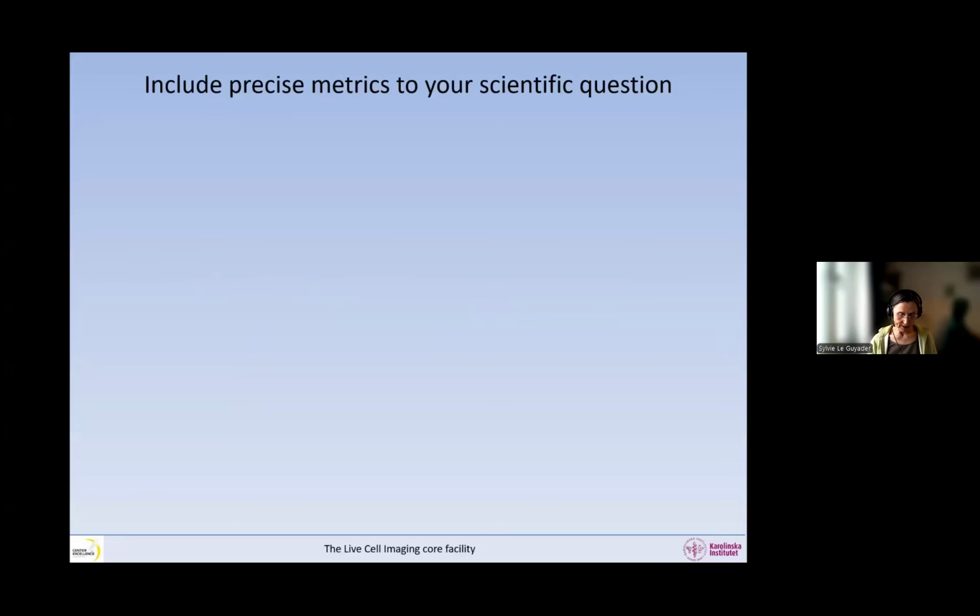Before I get started with publishing and displaying your images, I want to remind you that this thing about metrics and the scientific question is the center of the whole thing. So please, when you talk about what you want to extract from your images, do not say, I want to quantify, because unfortunately it has become a bad habit that people say, I want to quantify, and they don't say what they want to quantify. Quantify is like counting. You have to say what you want afterwards. If you avoid the word quantify, you will not have this problem anymore.